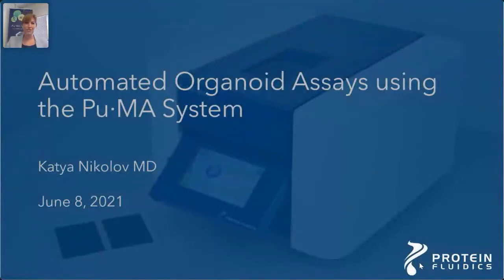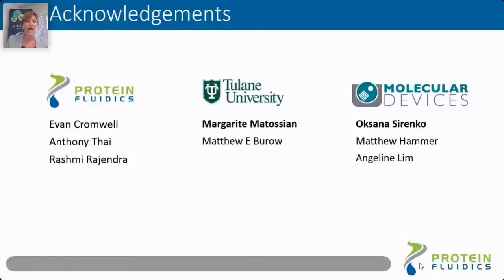Okay, well, thank you, Rashmi, for the introduction, and thank you, everyone, for joining the webinar today. So I will be talking about automated organoid assays using the microfluidic-based Puma system.